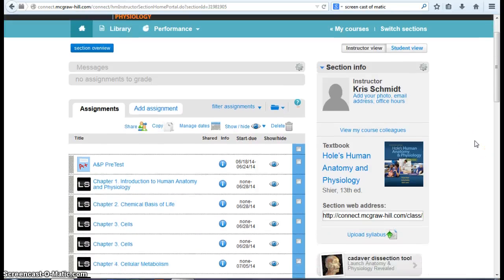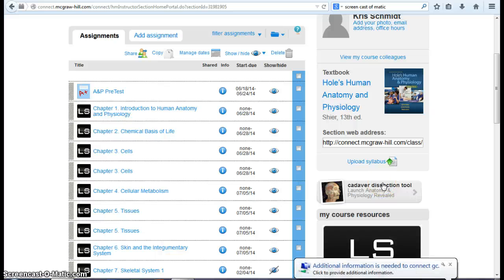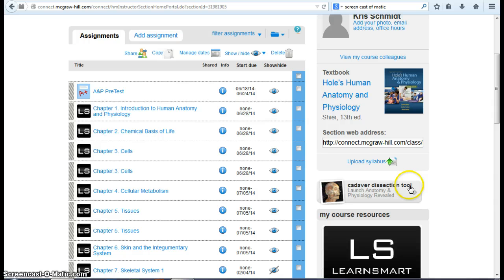So you don't have access to any of these slides that are mentioned in the materials needed sections in your lab notebook, so you'll have to have an alternate source, and this is your alternate source. Again, if you do want to come by Goshen College, you're welcome to do that too. I'm here to assist you if you need that.